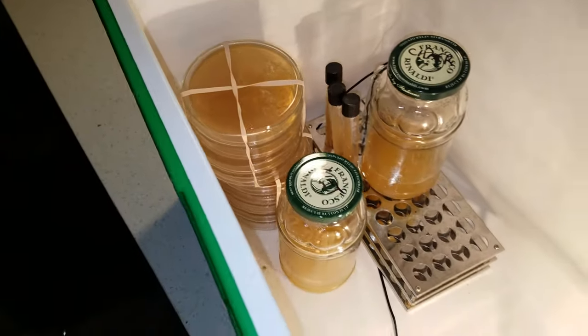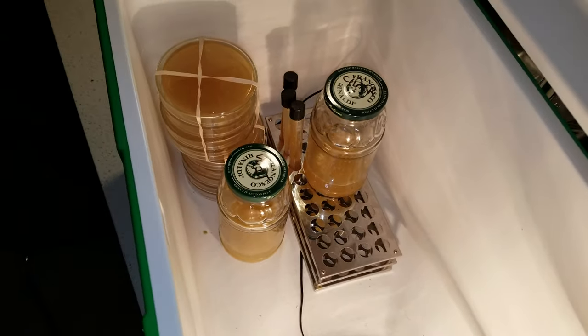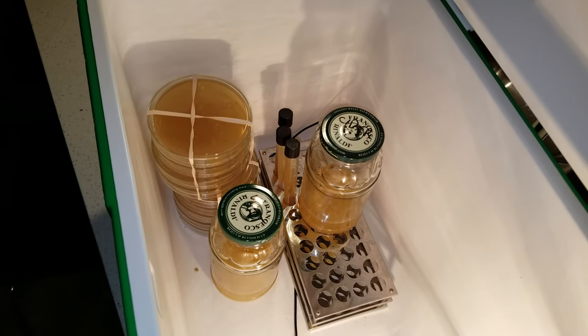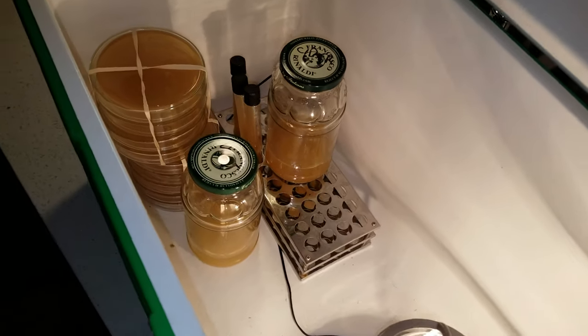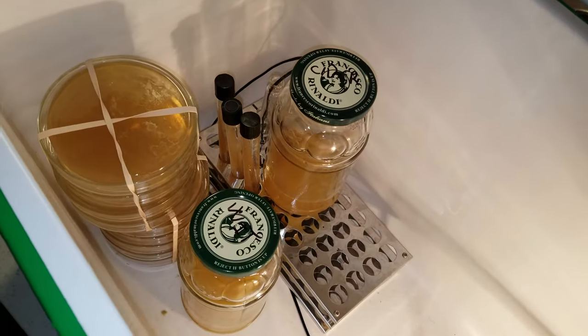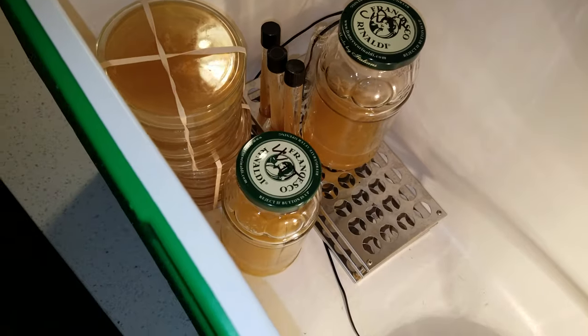As well as the agar plates sitting on the side here. You will also notice that I have two regular glasses here — one says cider and one says wit.